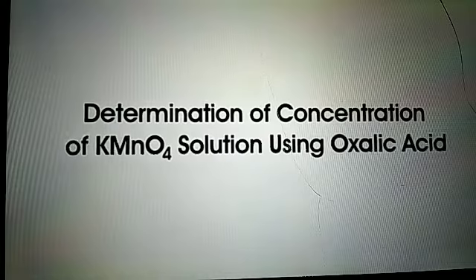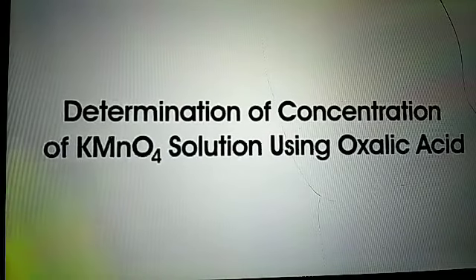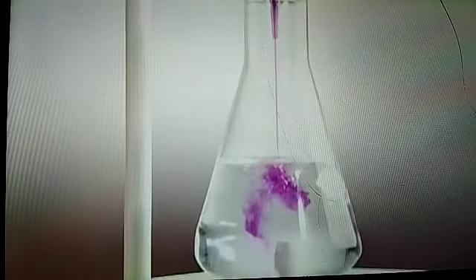Of concentration of KMnO4 solution using oxalic acid. Titration is a common laboratory technique used to determine the unknown concentration of a given solution.